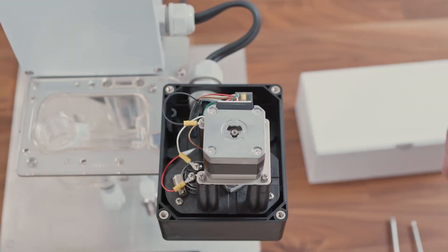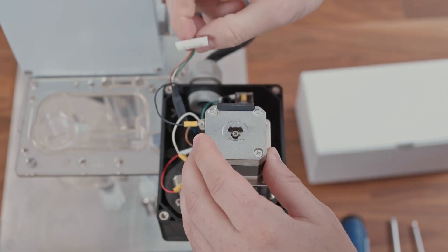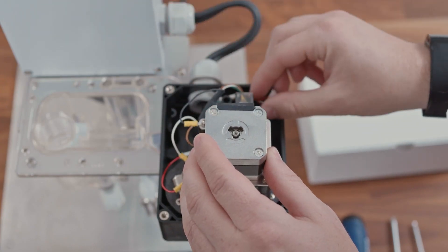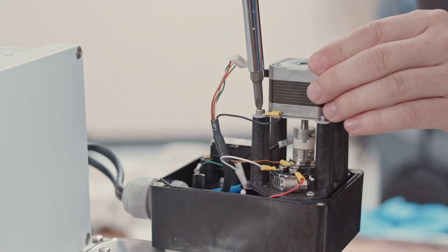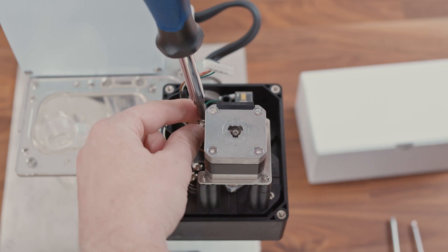The first thing we'll do is replace the motor. You want to first disconnect the wires from the motor, being careful not to pull too hard because there is a ground wire connected to one of the screws holding the motor in. Now we can remove the four Phillips head screws at the base of the motor, making sure to keep track of these screws.